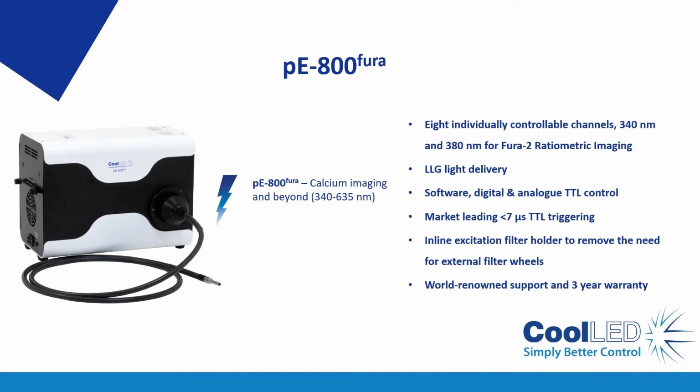The pE-800 fura has 8 individually controllable channels, liquid light guide delivery, software, digital and analog control, including market-leading less than 7 microseconds TTL triggering. The inline 8-position filter holder removes the need for external filter wheels.